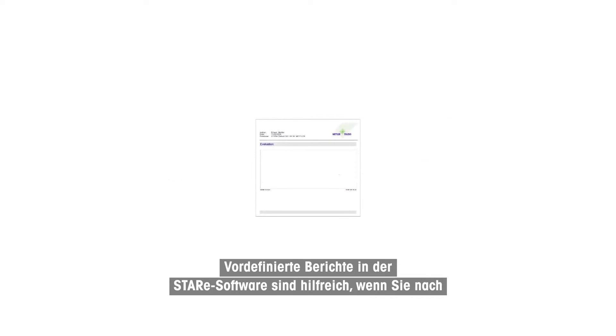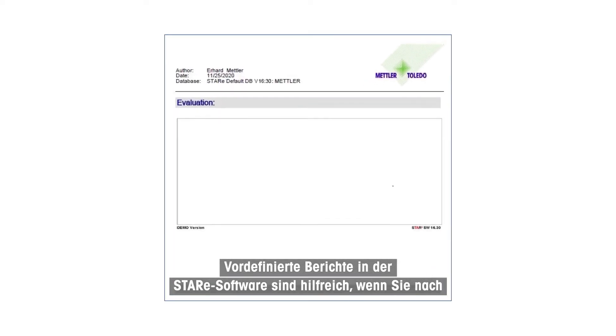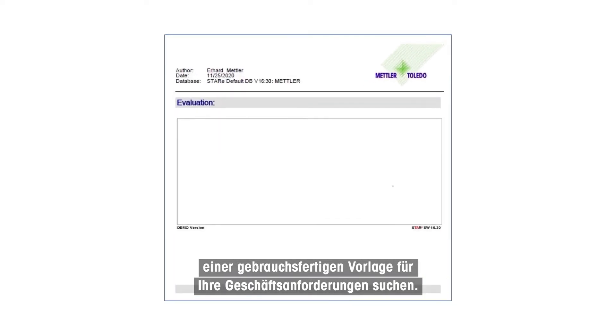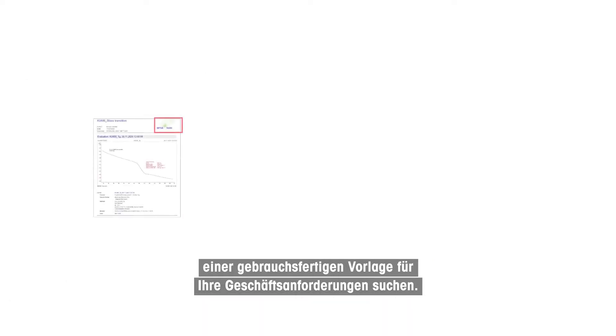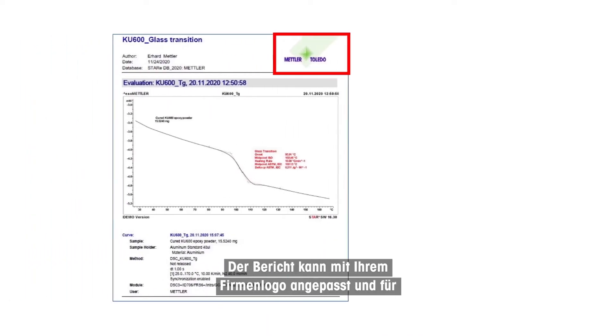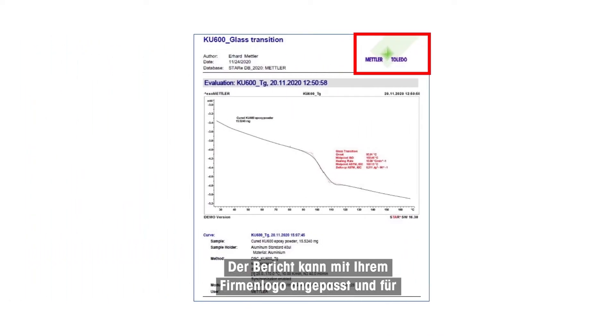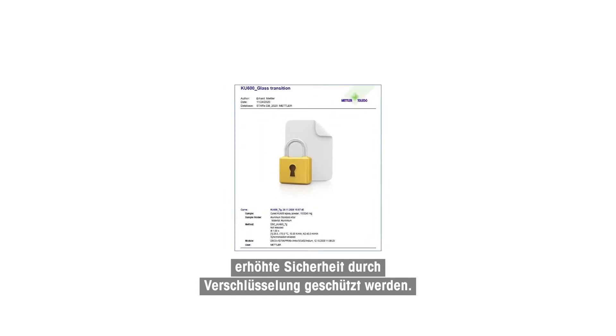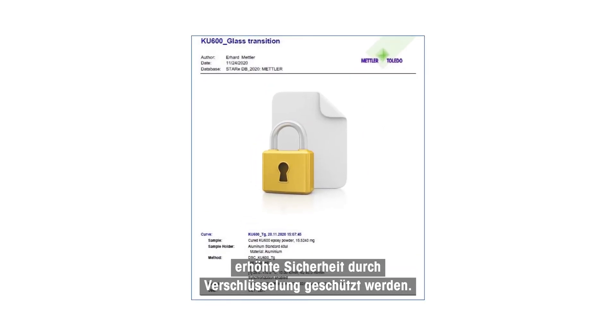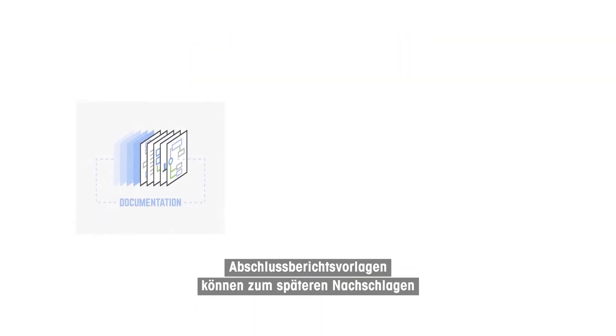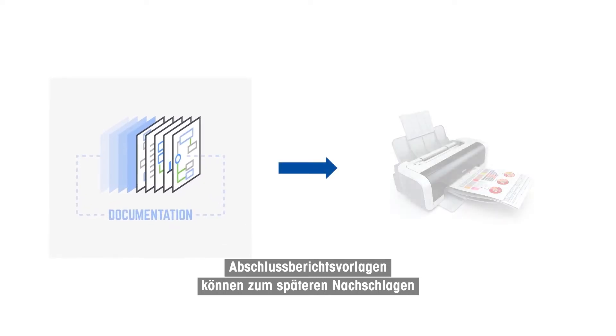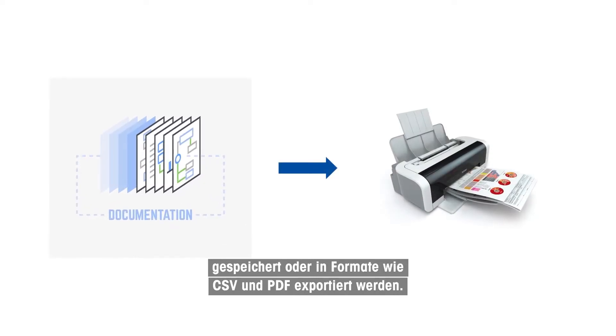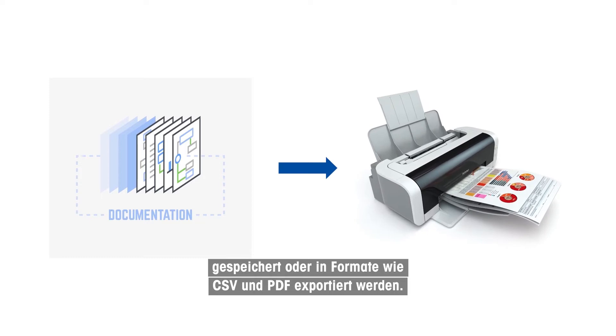Predefined reports in STAR-E software are helpful if you are looking for a ready-to-use template for your business needs. The report can be customized with your company logo and protected with encryption for enhanced security. Final report templates can be saved for future reference or exported into formats like CSV and PDF.